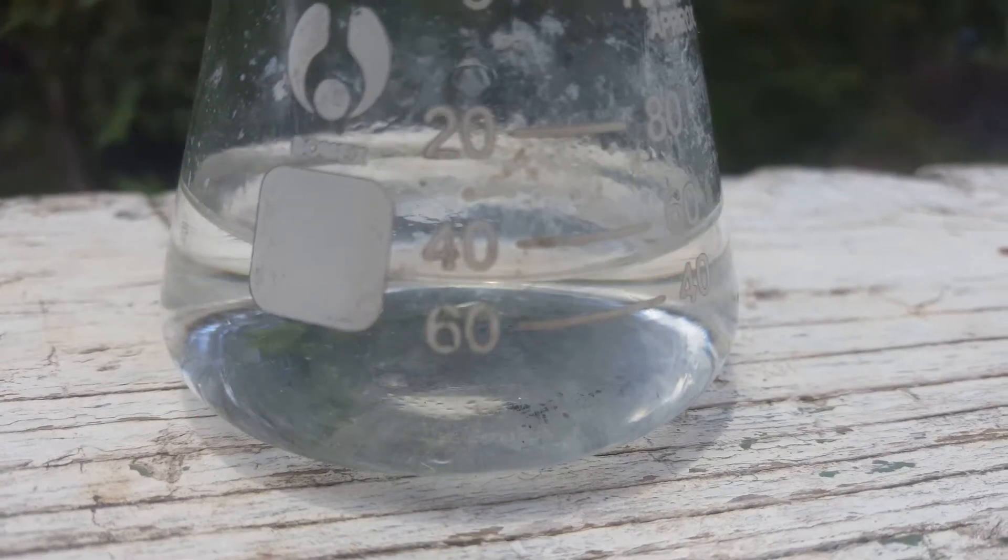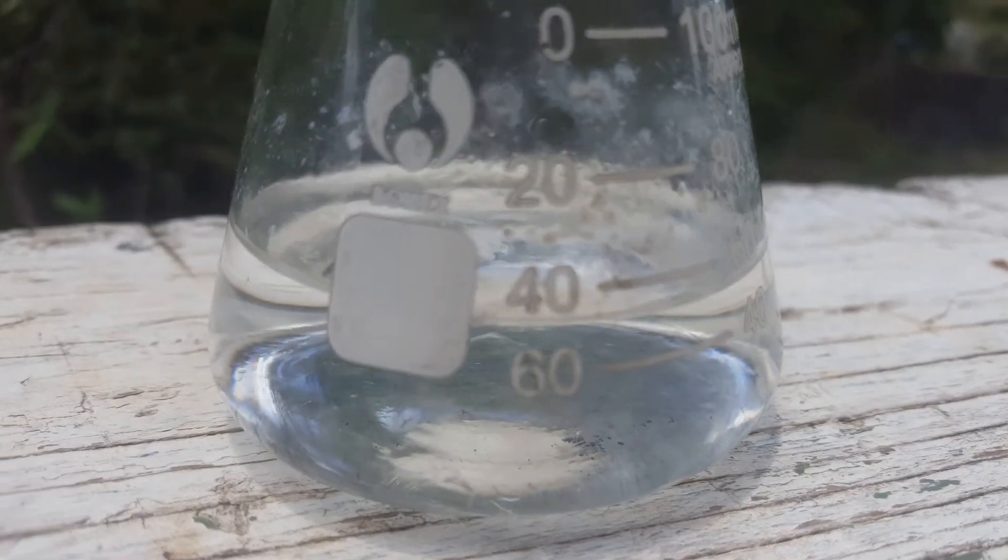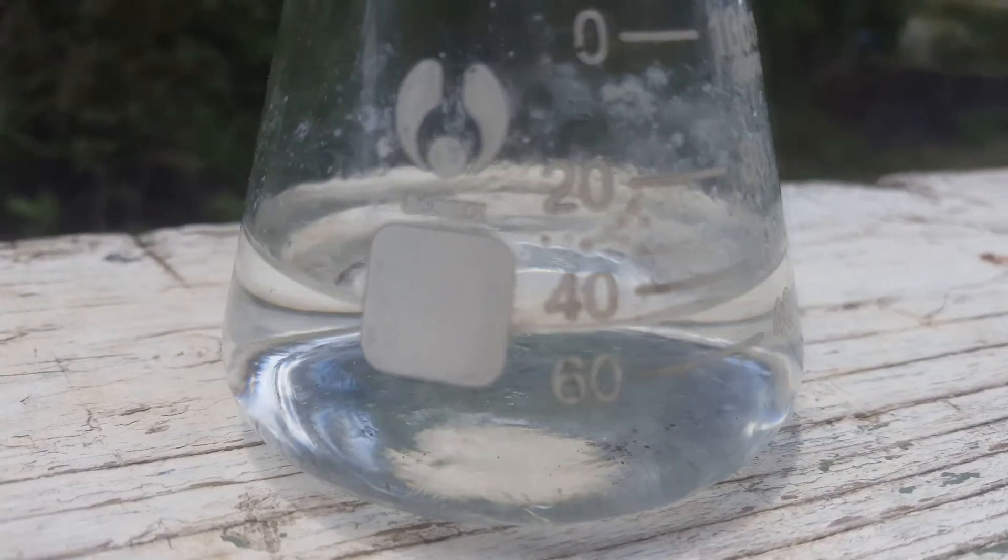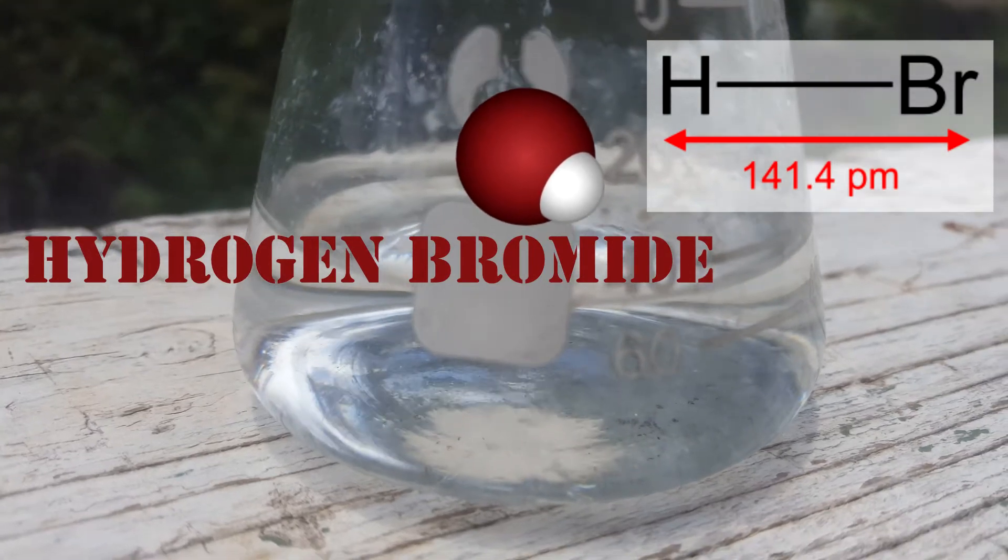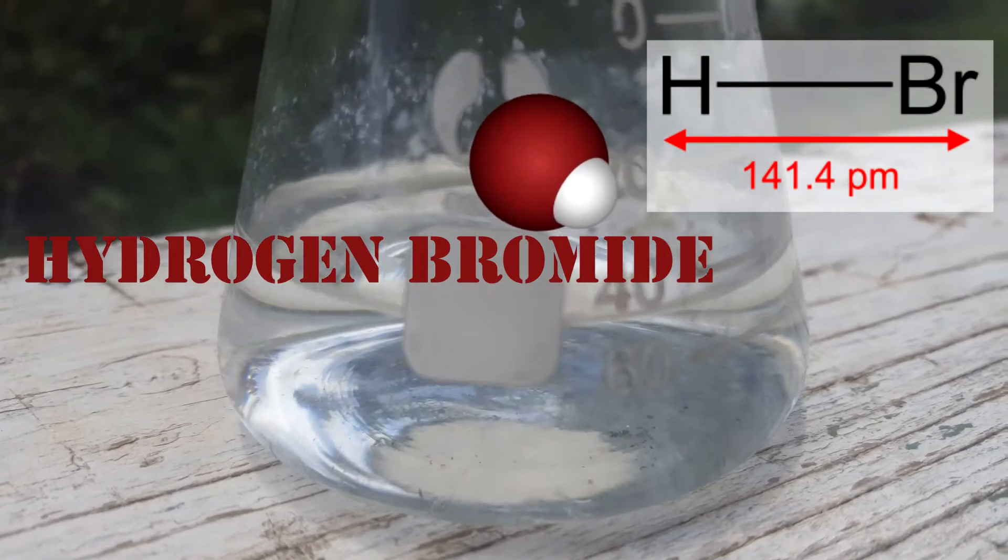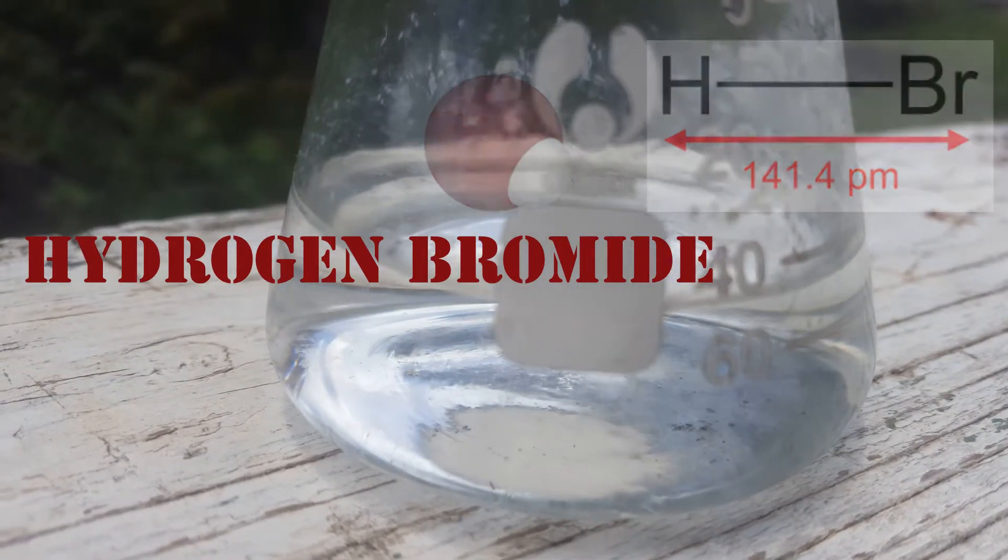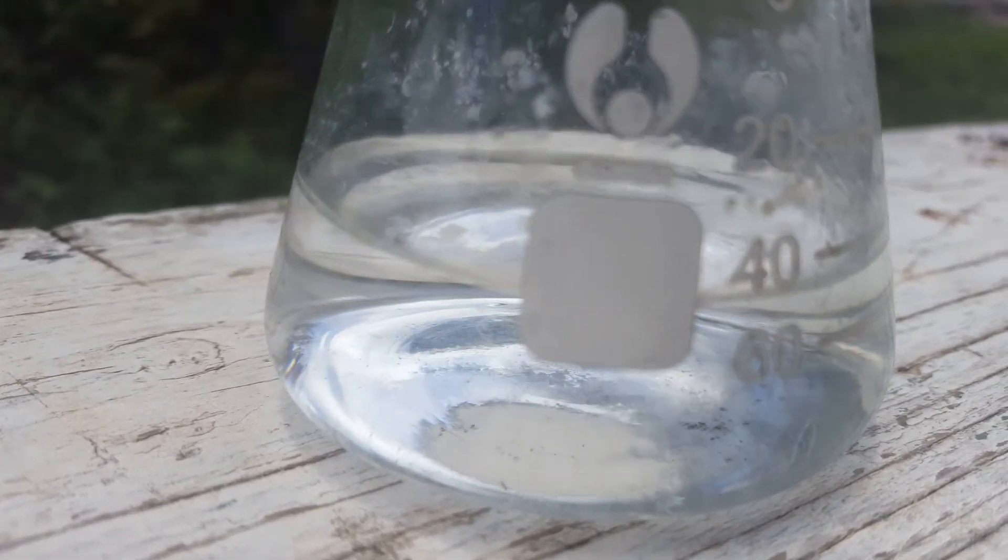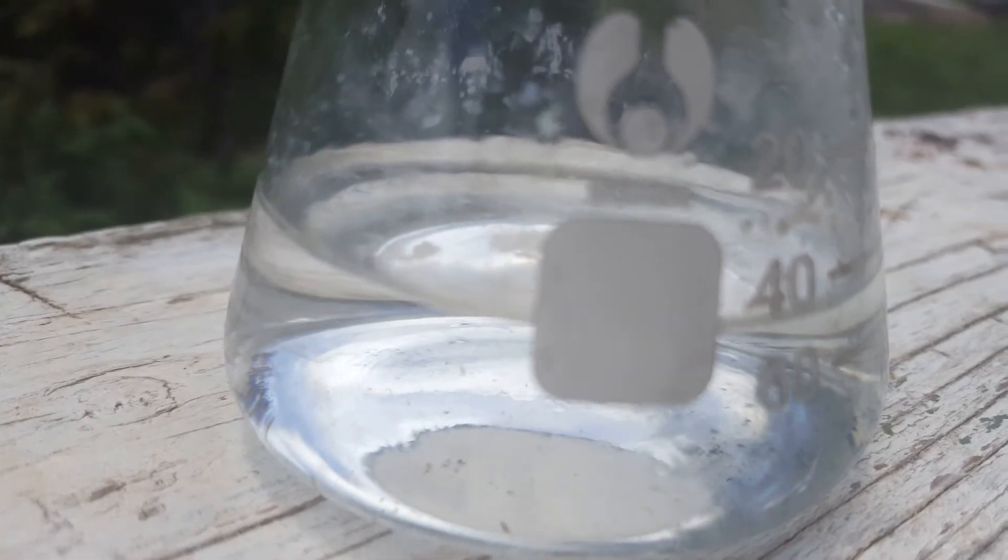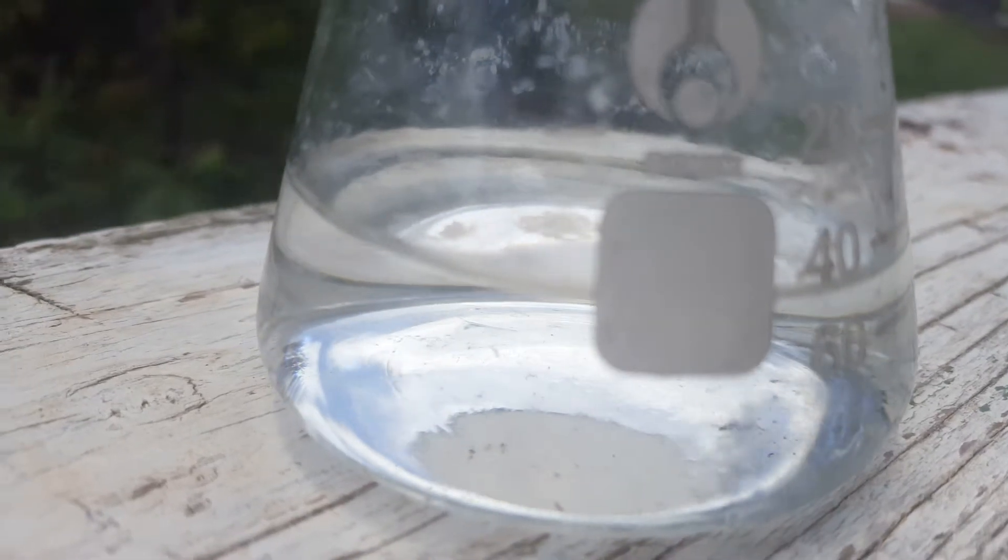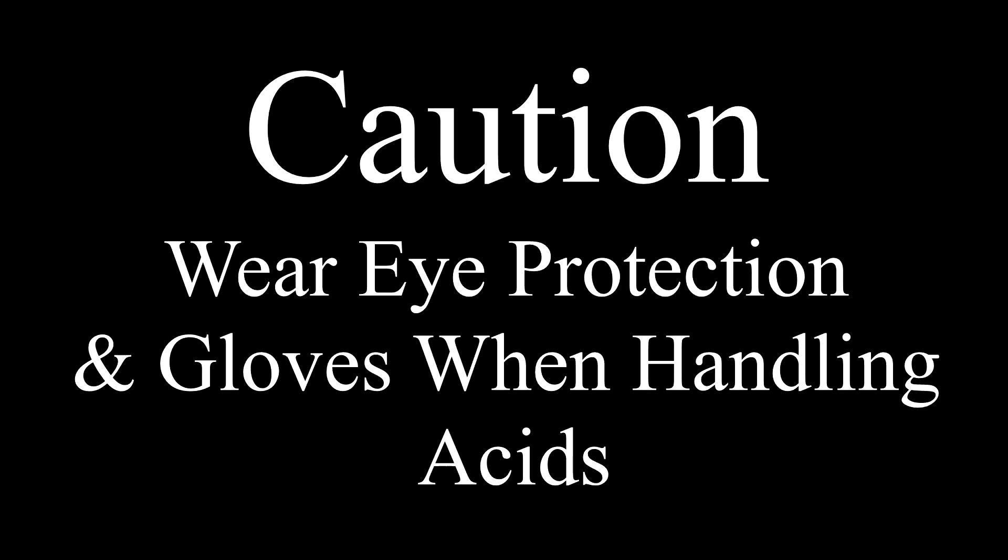Hydrobromic acid is a strong acid formed by dissolving the diatomic molecule hydrogen bromide in water. Hydrobromic acid distills at 124 degrees Celsius and contains 47.6% hydrogen bromide by mass.